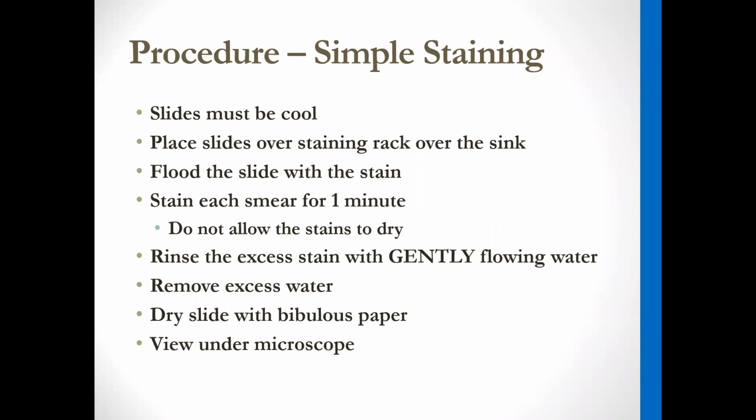And then you still have that clothespin on your slide, so you don't get stain all over yourself, and you give it a little flick to try and get any excess dye off. And then you are going to use a spray bottle and very gently, starting at the top of the slide, rinse it. You don't want to blast your cells with a big stream of water.